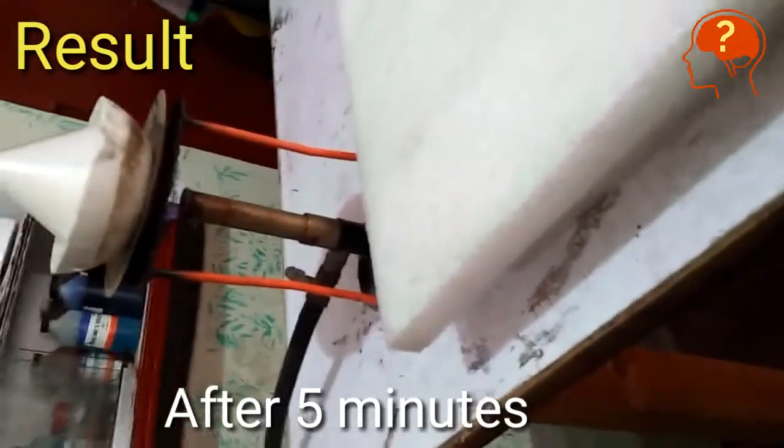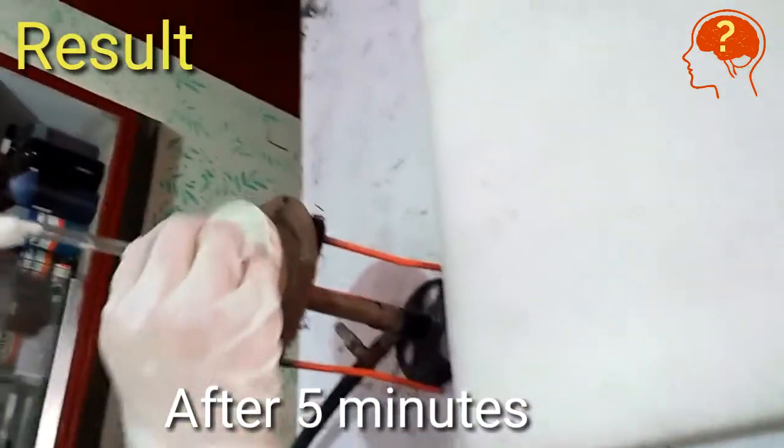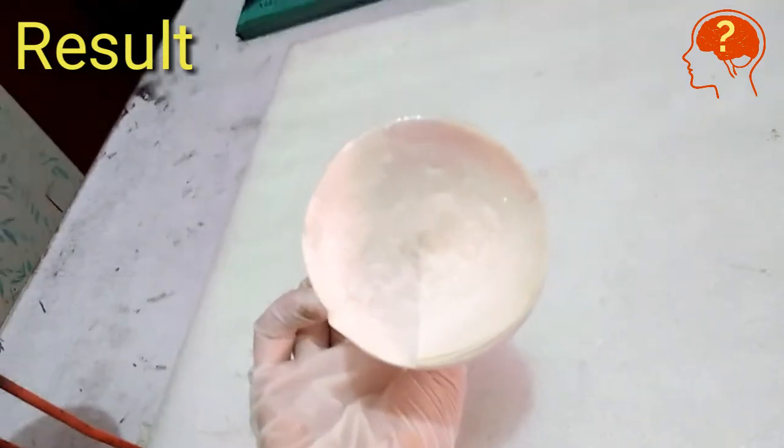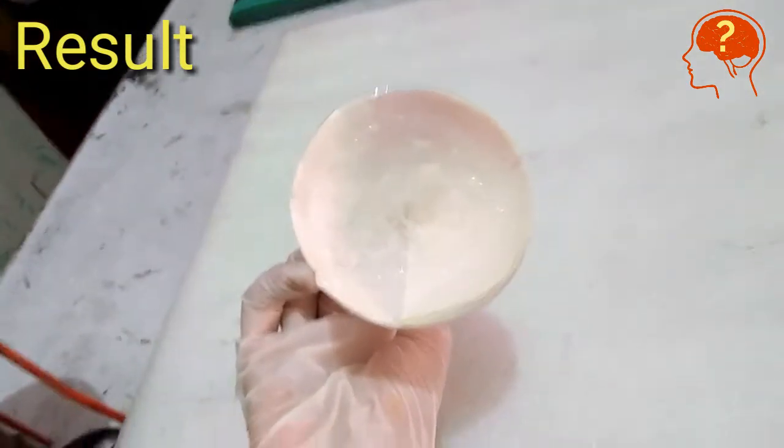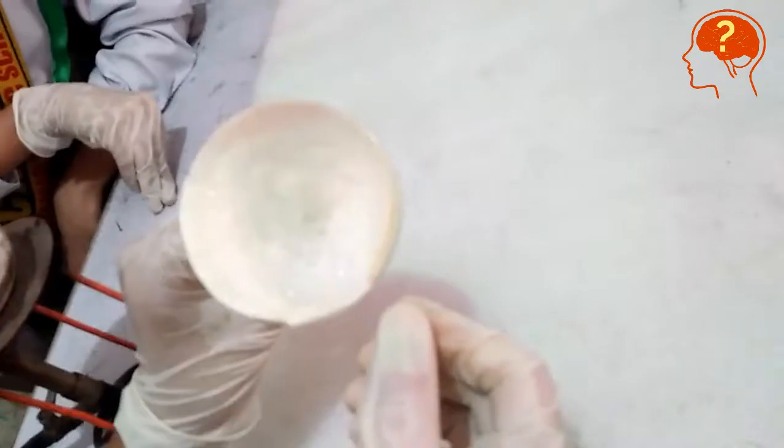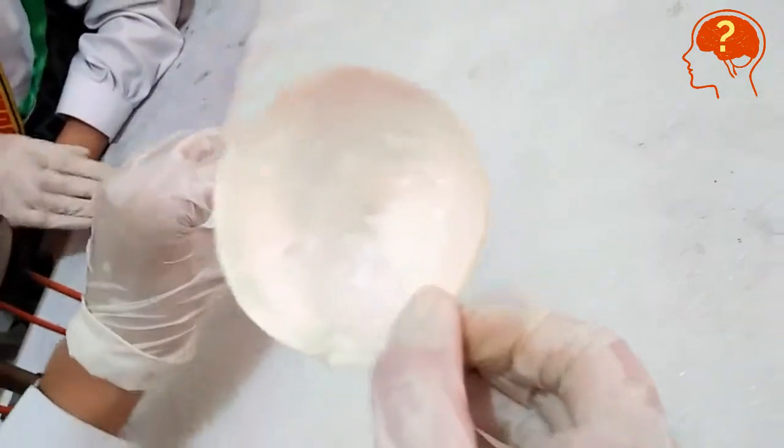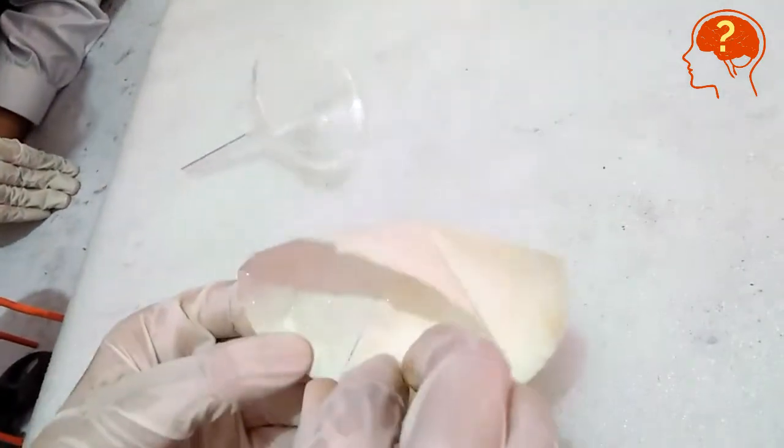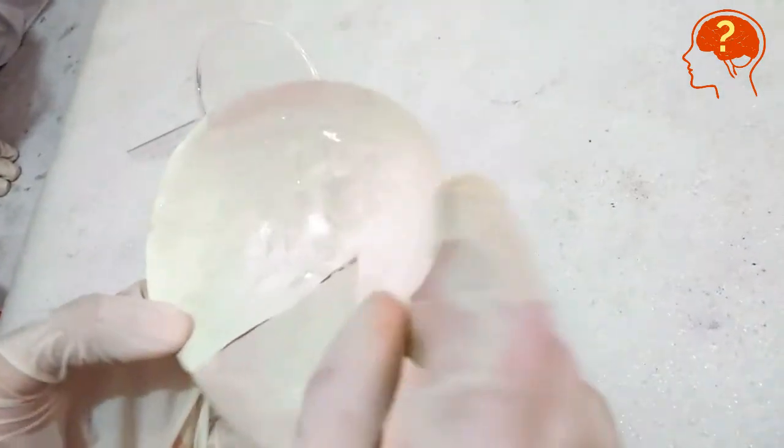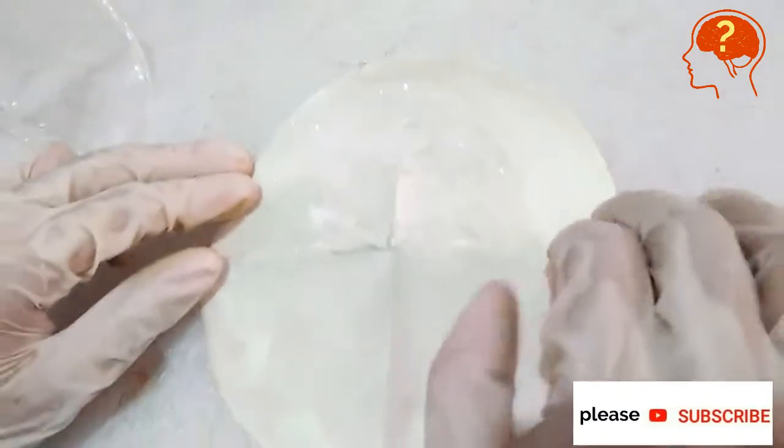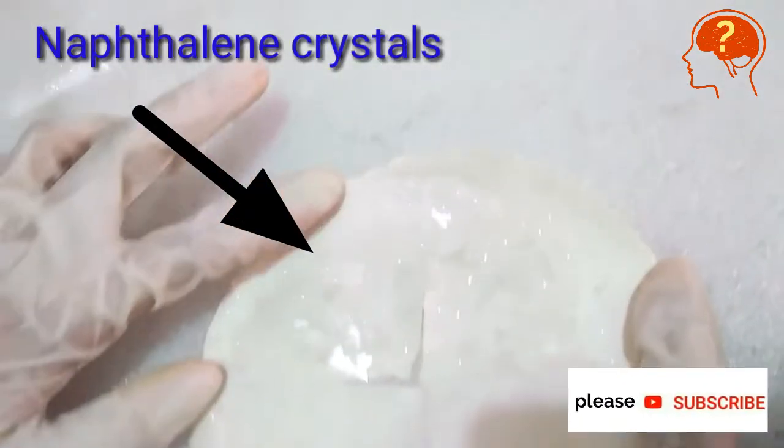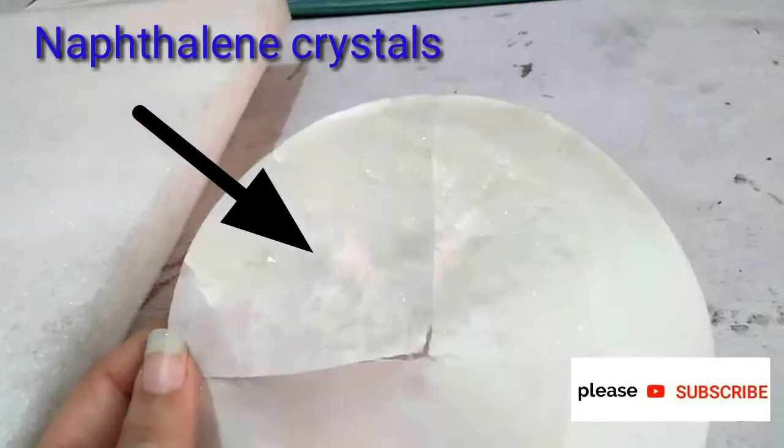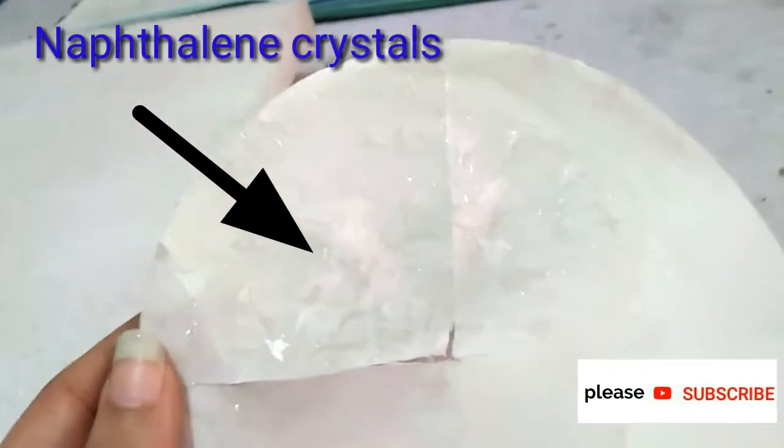Now you can see here crystals are present on filter paper. Remove the filter paper and check for crystals. You would see white shiny crystals are present on the filter paper. These are the crystals of naphthalene, and sand would remain inside that china dish.